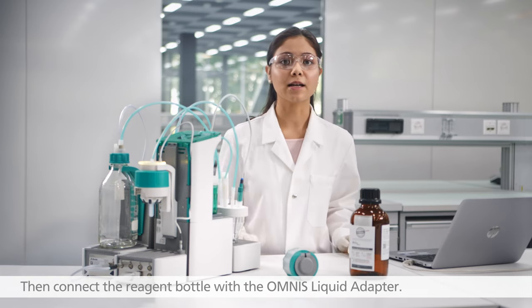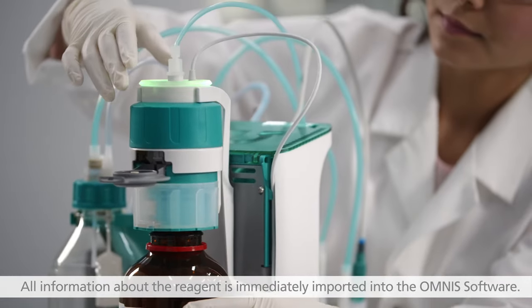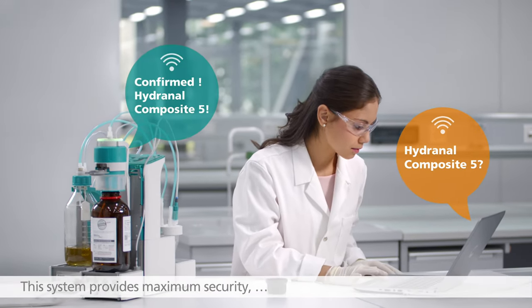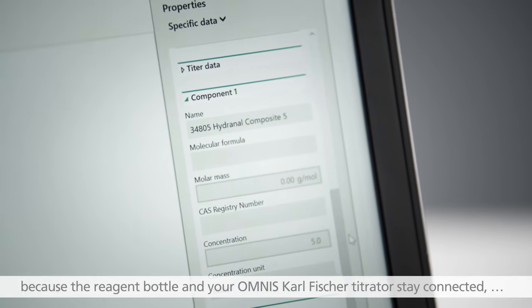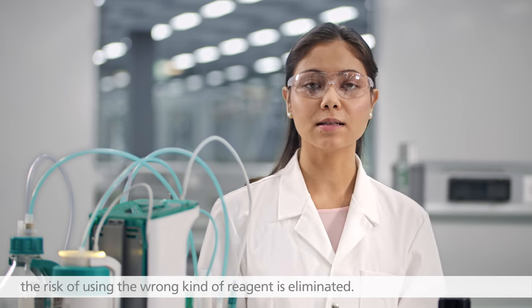Then connect the reagent bottle with the Omnis liquid adapter. All information about the reagent is immediately imported into the Omnis software. This system provides maximum security, because the reagent bottle and your Omnis Karl Fischer Titrator stay connected, and the risk of using the wrong kind of reagent is eliminated.